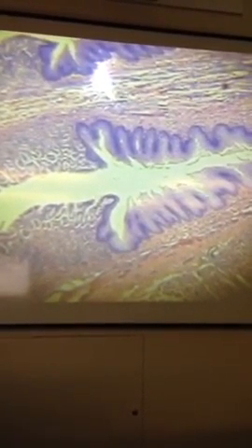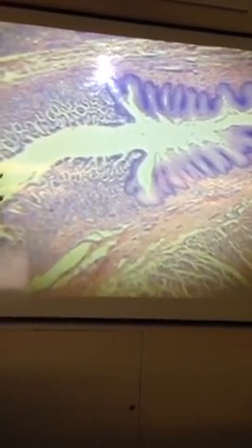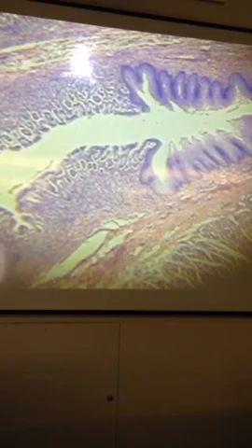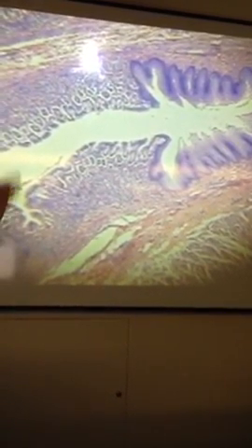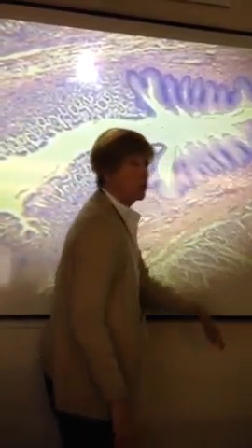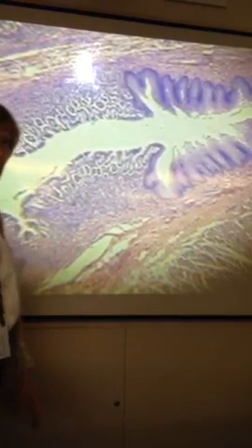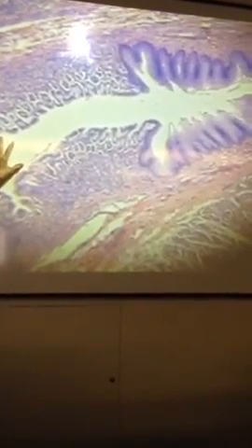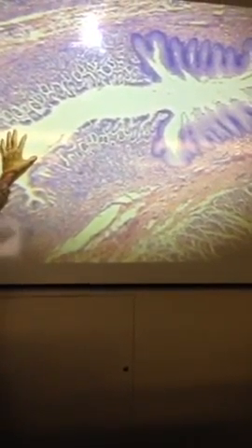So this is where the cardiac sphincter would be, where the esophagus now is the cardia of the stomach. And this is how abrupt the histology changes. So we'll move on over and I'll go to a higher magnification. And what is this a slide of again? Esophagus, stomach. Okay. Esophagus on this side with stratified squamous. This is the mucosa. I don't make you identify submucosa or muscularis on this one because we have way better ones.